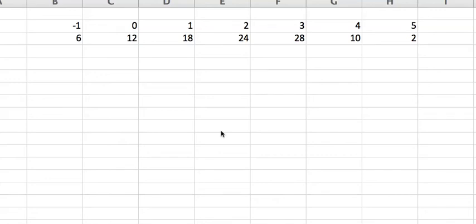Okay, now I am going to show you how you go from the sizes you measured in a set of sieves, or possibly retrieved off a laser diffraction analyzer, that give you the amount of sediment in a size class, and convert that to the cumulative probability numbers that we need to make the graph we just saw. Here are some sample numbers.